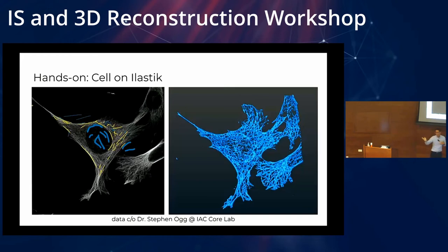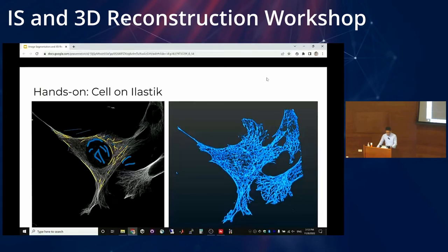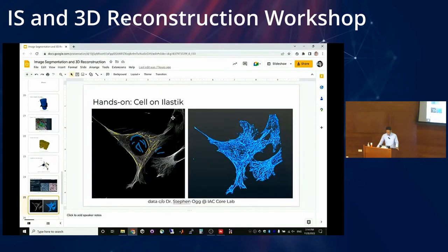It's slightly better than just using thresholding. And just like texture classification, it depends on how much effort you want to put in. So the more data, the better. But you have to be careful. It's an art, right? So it's good to also do brushing along the edges so it learns about the separation of materials. Anyway, let's get into that now. If you want to follow through, you can because you have the data.